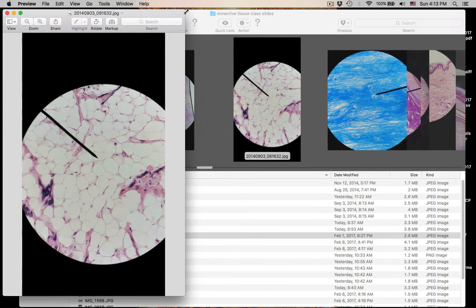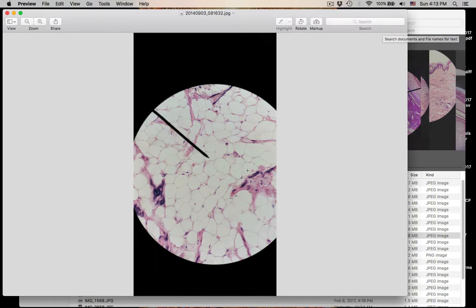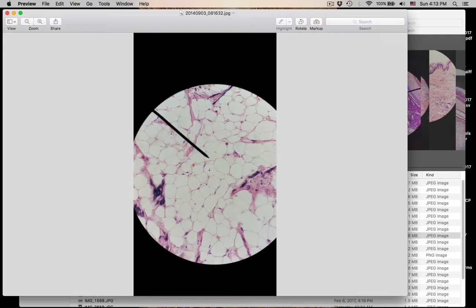Number nine was adipose tissue. All these cells are called adipocytes. Their nuclei are pushed to the periphery of the cell. This is just a fat-storing cell — adipocytes.